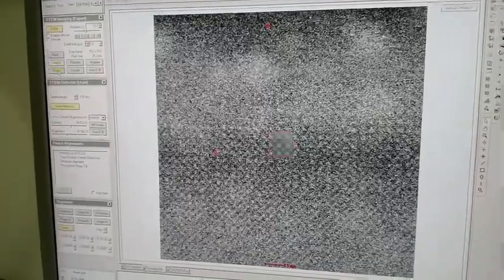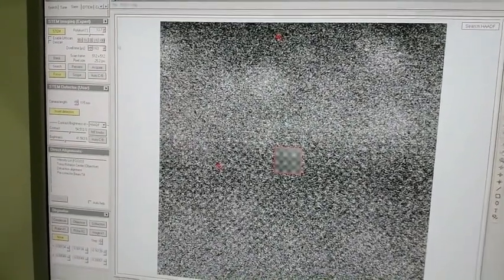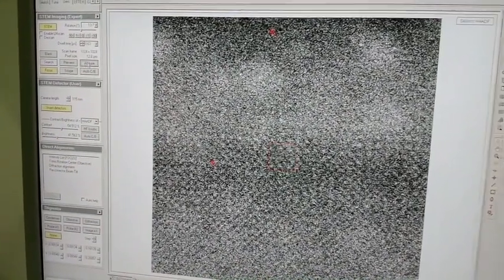Hello, today we are at the Titan microscope in STEM mode and I'm going to show you how to fight STEM distortions. So let's tune a little bit, maybe correct astigmatism and optimize focus. When ready, we press the acquire button.